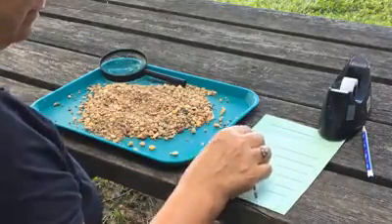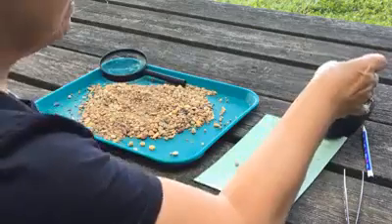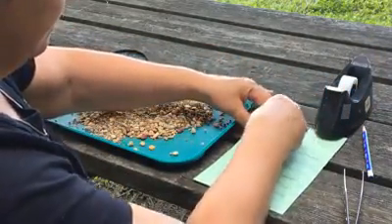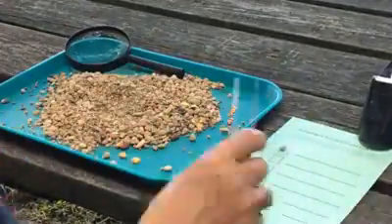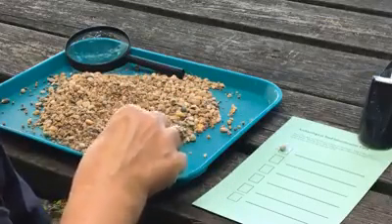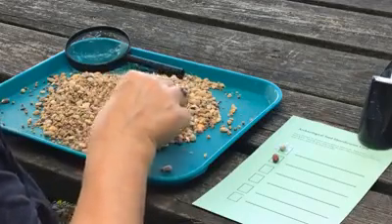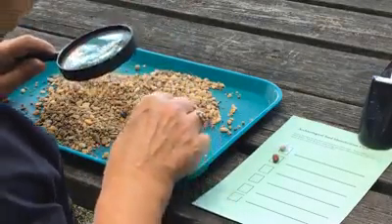One right there. And then to use their tape to tape them down in these little boxes. And then continue looking for seeds. I see one here. And I'm going to need a hand lens to look for some of the smaller ones.